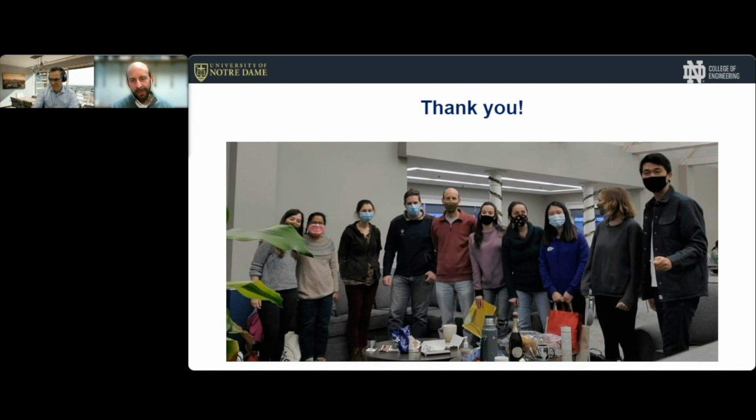I think that's an interesting question, and we haven't looked into that. But I guess the question is, is there a way to use in some way the OCT information to identify the type of microbial growth within a biofilm? I'd say, if you were able to relate cell density to a certain type of microorganism or maybe filaments, it's possible that you could. But since we can't actually see cells, in most cases with OCT, we're not able to capture the morphology of single cells. We can't use that as a way to differentiate bacteria.